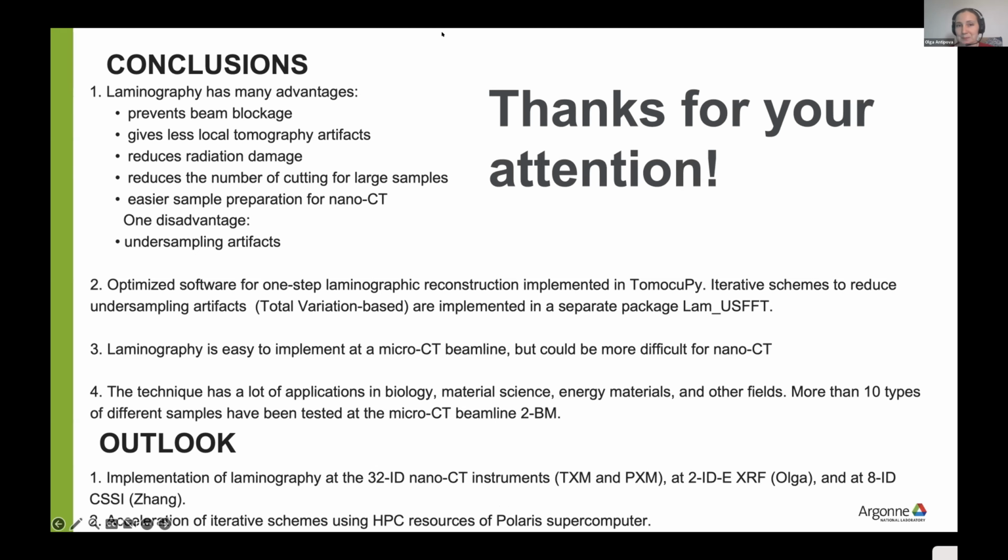Thank you, Victor. Does anyone have questions for our last speaker? I had a question. Victor, very nice. I was wondering, when you said that for the Kapton tape samples in between the Kapton tape, do you still need to cut it down into that 1 millimeter by 1 millimeter, or can it be a little bit larger? I think it's not difficult to cut the sample to 1 by 1 millimeter, but it can be larger.